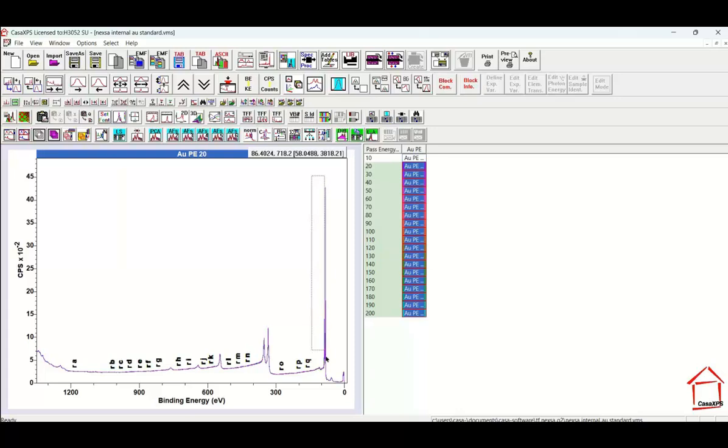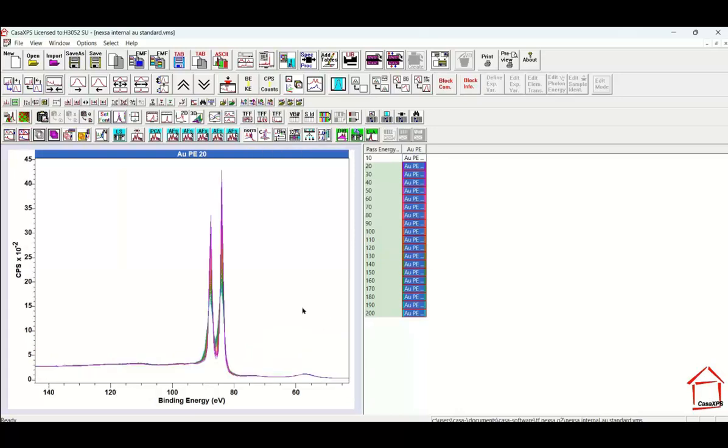So yes, this is now transmission corrected data relative to an Escalab 250xi pass energy 40 transmission corrected spectrum. So in principle, all of these spectra should look identical to the Escalab data after they've been transmission corrected.